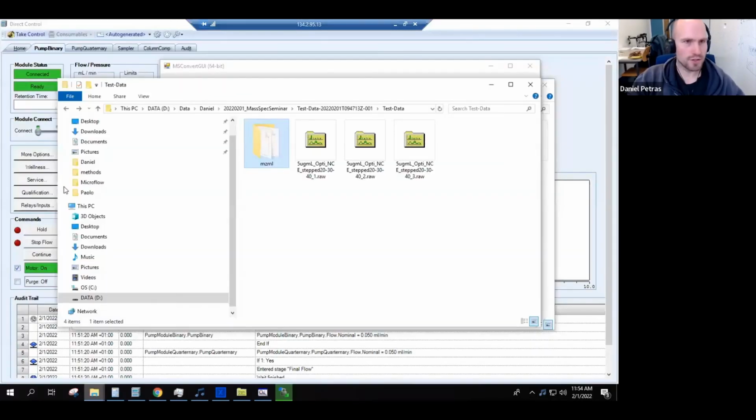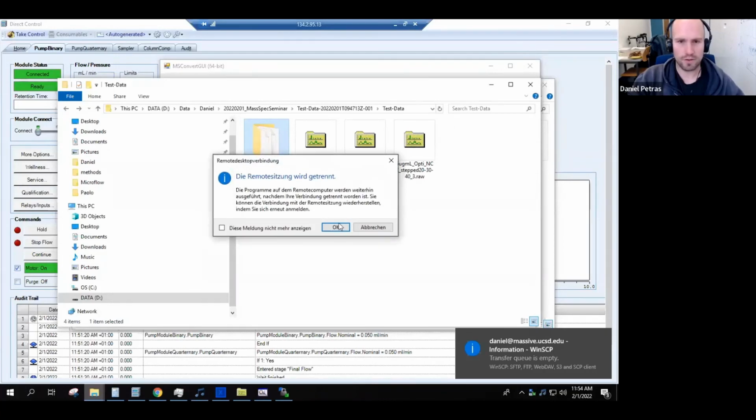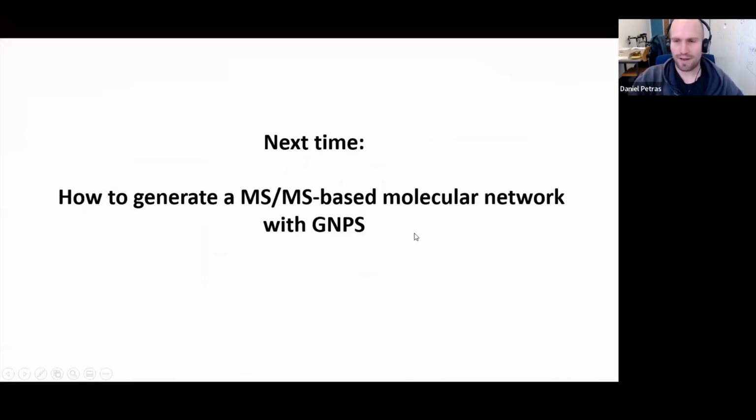All right, so with that, let me close the remote session. That was basically all I wanted to show you today. That leaves me just to tell you what we're going to do next time. Next time we're going to use the data we just uploaded and create a first molecular network with that in GNPS. And with that, we're going to do questions in a second.